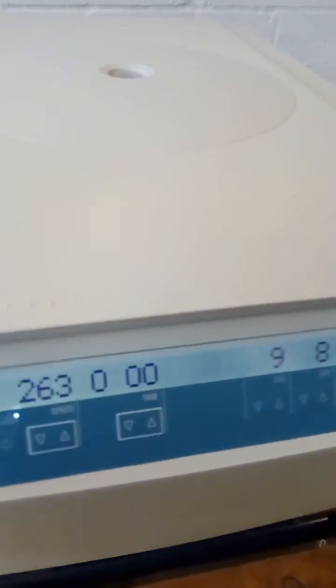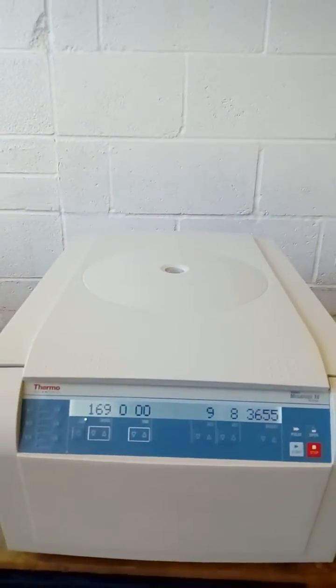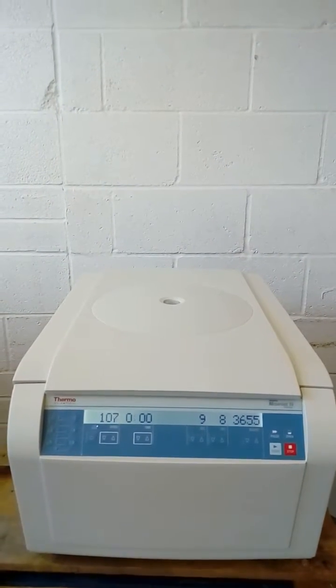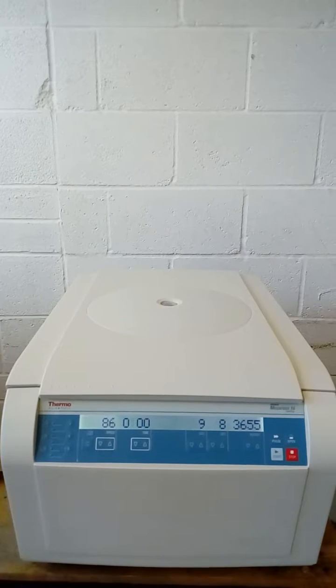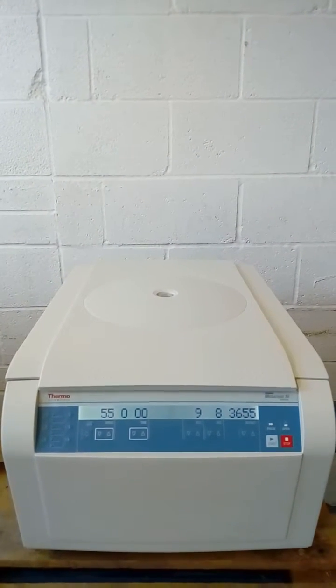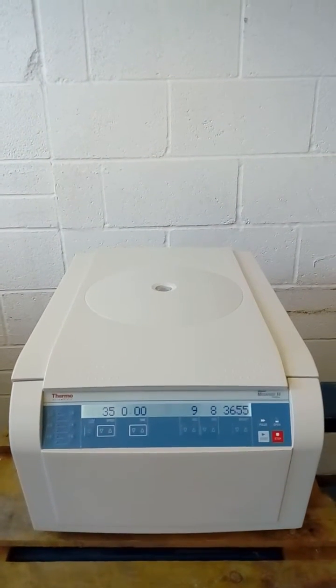The centrifuge has completed its run. If you have any further questions or enquiries, please contact Richmond Scientific by telephone or at richmondscientific.com. Thank you.